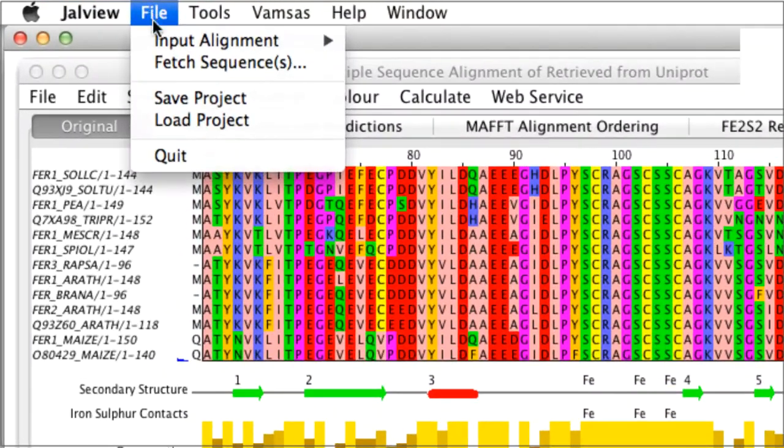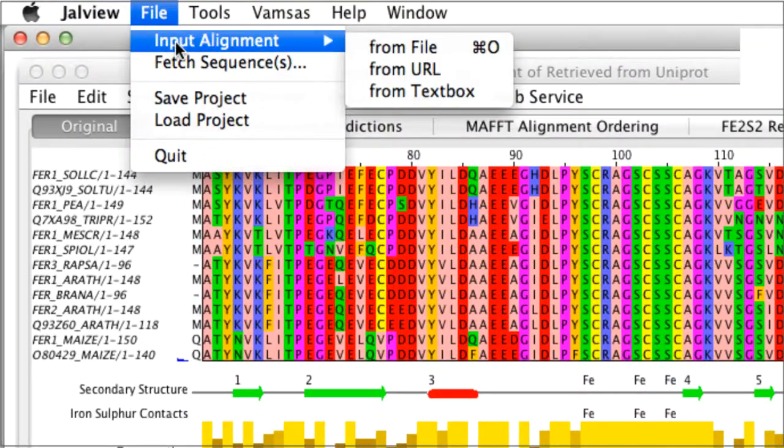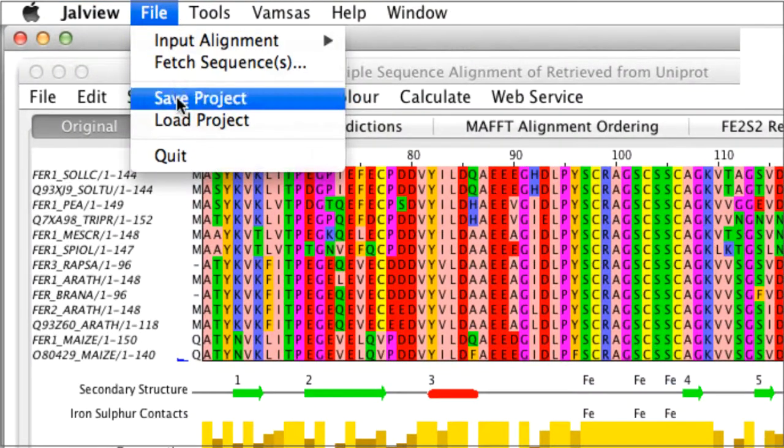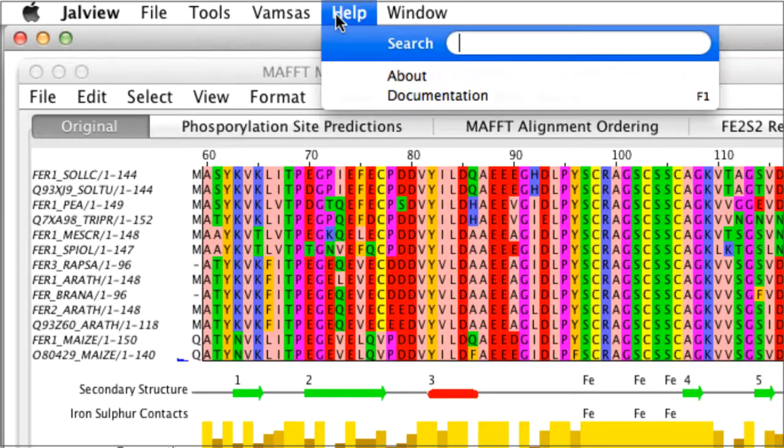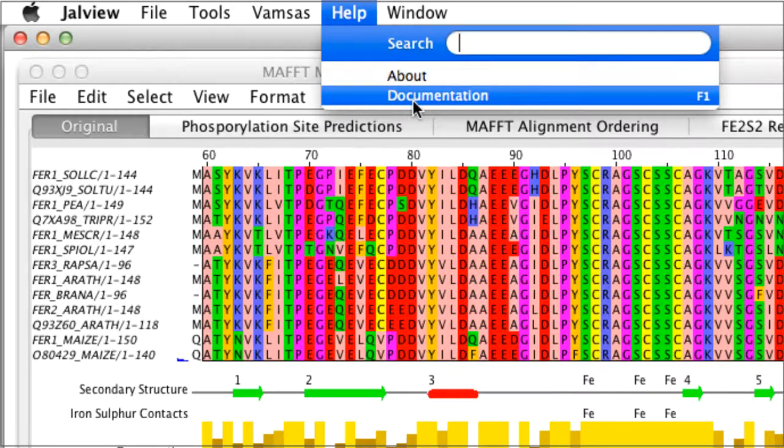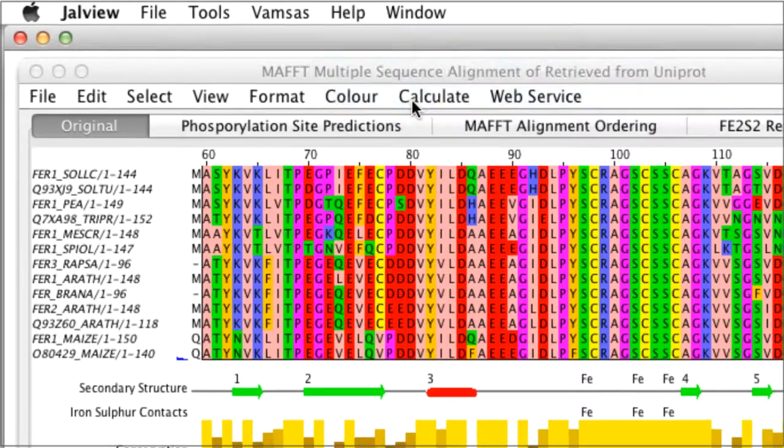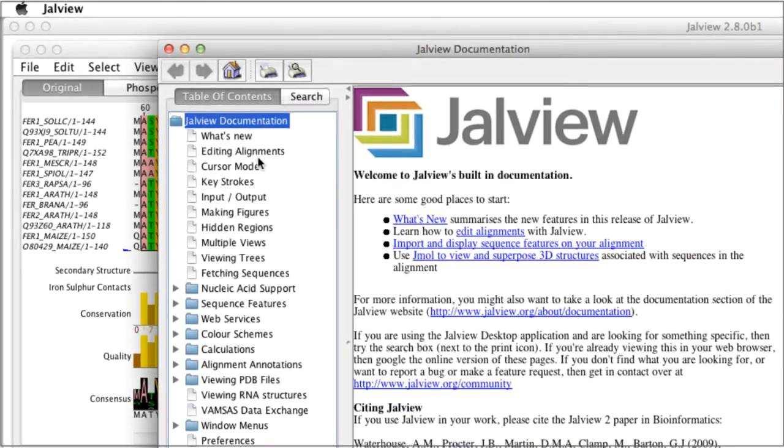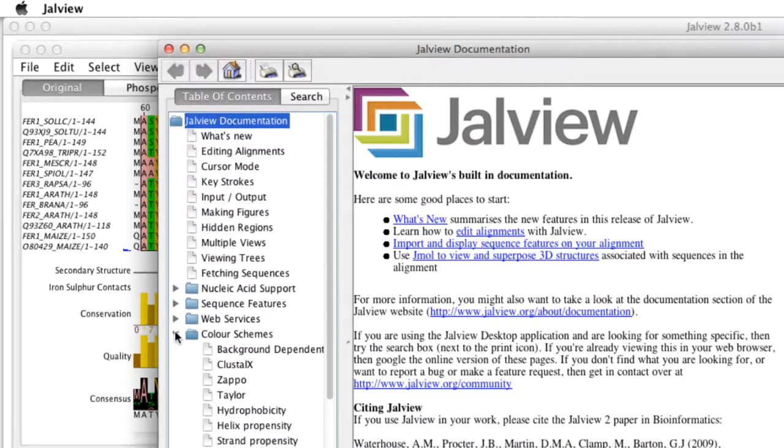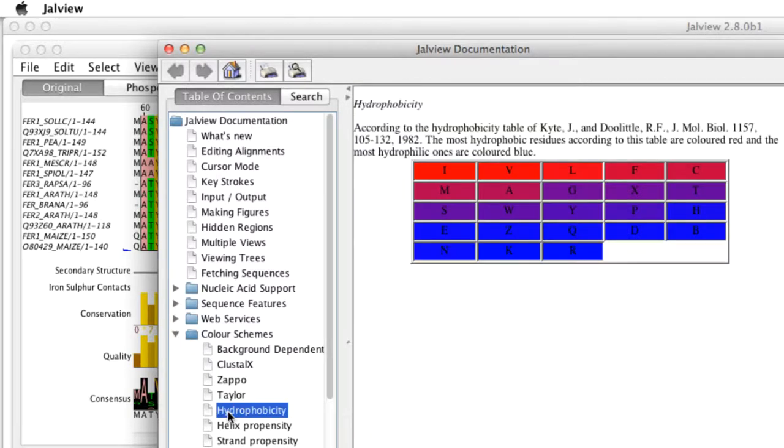The file menu allows us to read and save alignments and projects. From the help menu we can access the online help documentation. Jalview has a comprehensive manual that can be viewed in its own window.